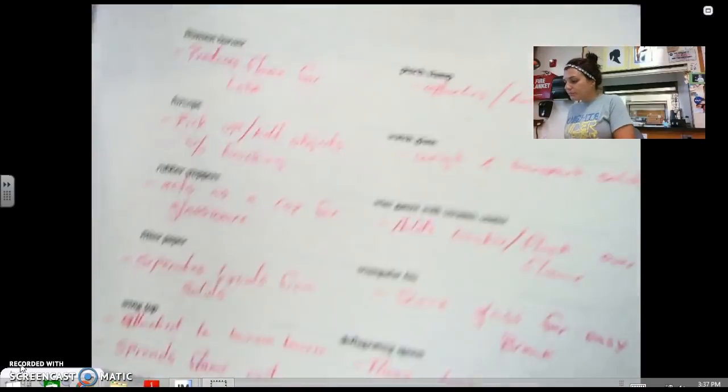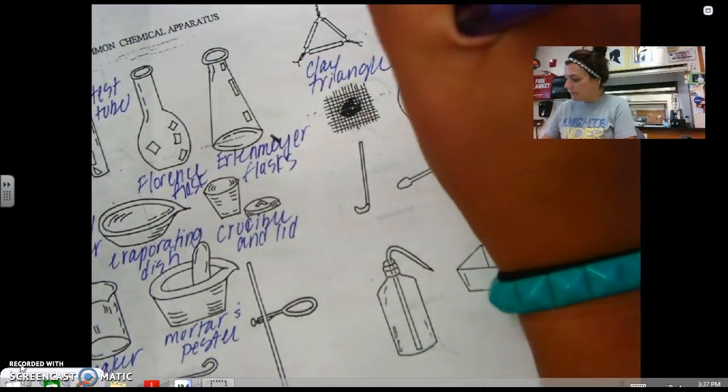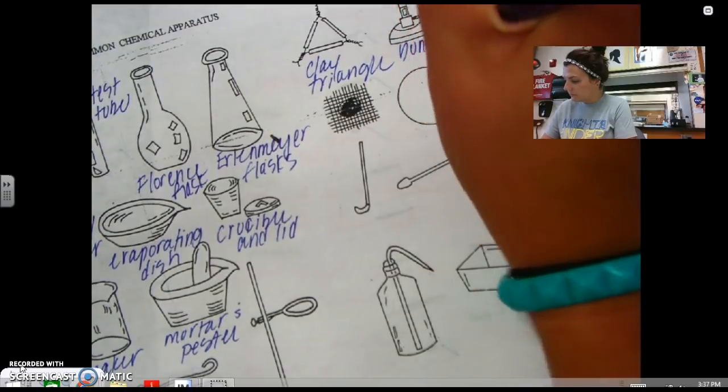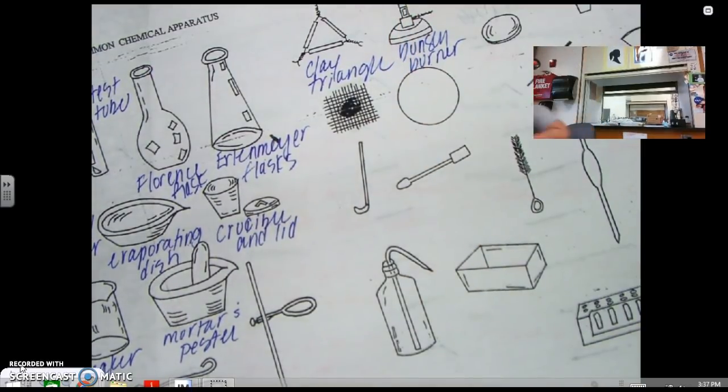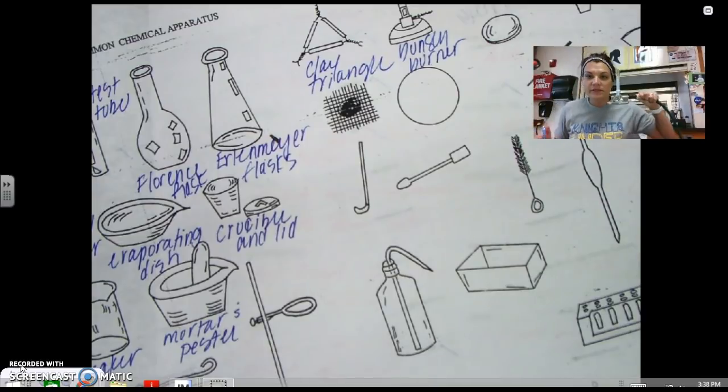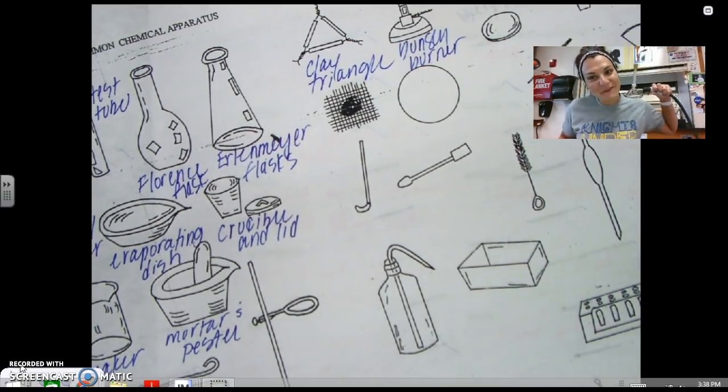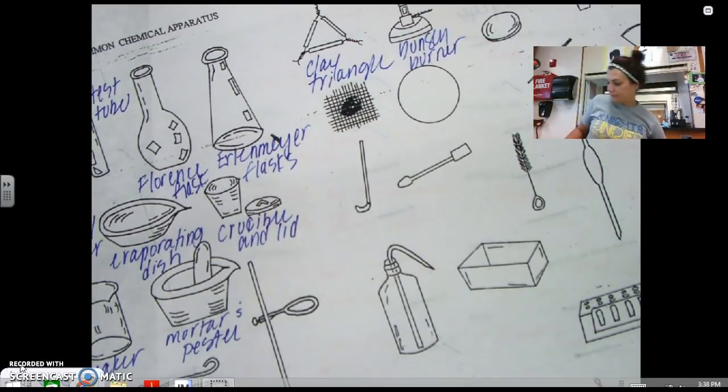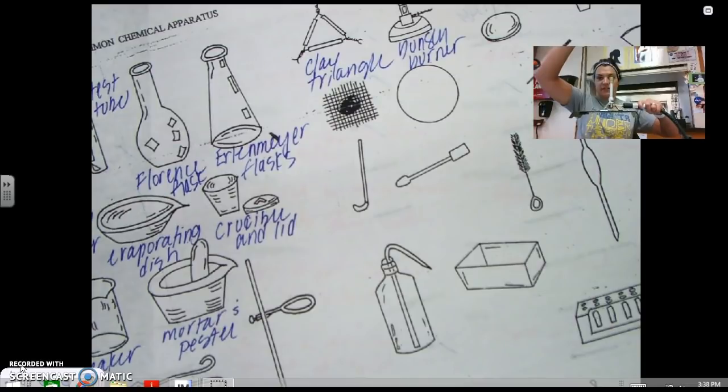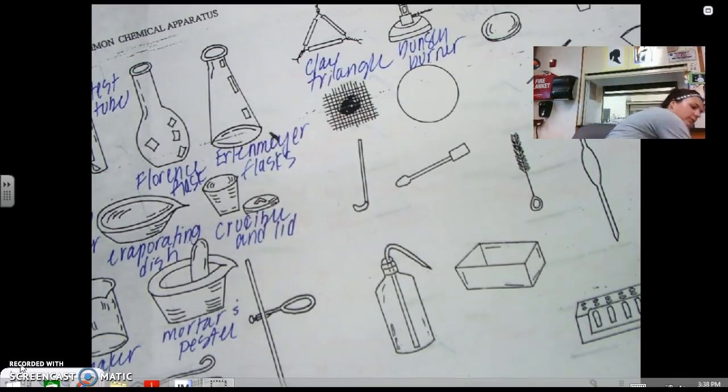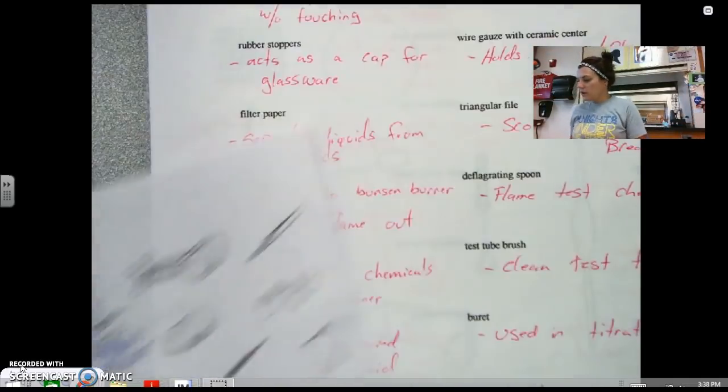Next thing. Bunsen burner, obviously, makes fire. Bunsen burner is right here. Before we use a Bunsen burner, we'll talk about how it's used. These are one of my favorite things because it's fire. I like fire. Bunsen burner. And you'll notice how nicely it goes underneath our ring stand like this. It can just sit there. So we'll talk more about that when we get to a Bunsen burner.